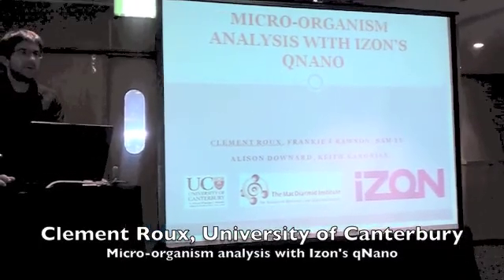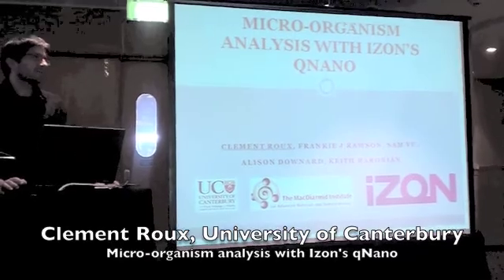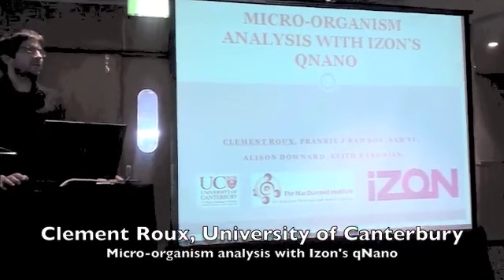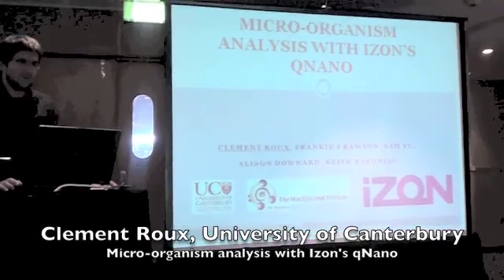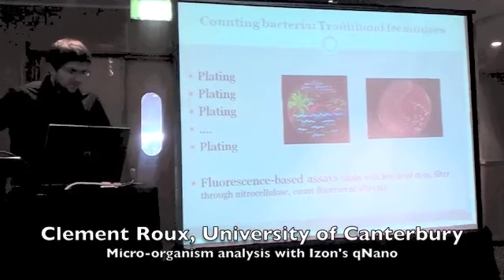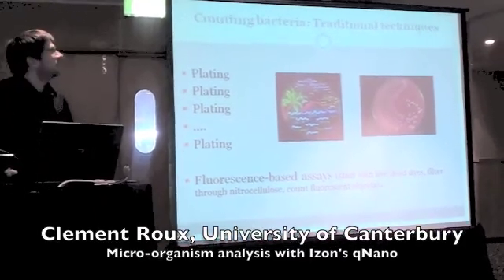What I'm going to tell you about today is a rather incomplete picture. It's ongoing research. Many times you might think, oh, why haven't they done this? Well, the answer to all these questions will be: not yet. It'll be very soon. Okay, so now, analyzing microorganisms by qNano: why and why.